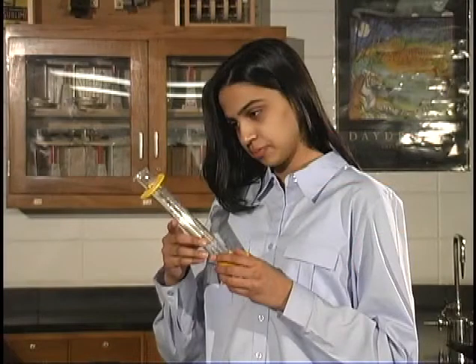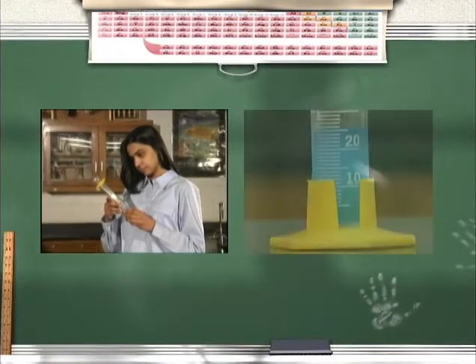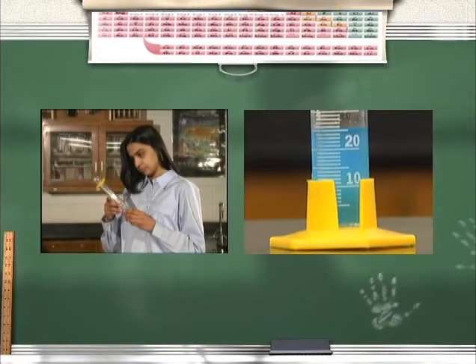Now, we are going to make some volume measurements. We are going to want to make sure we read our instruments correctly as we make these measurements. First, let's find the volume of a liquid. Here, we have a graduated cylinder with a colored liquid in it. In your notes, write down the measurement you read. In case you have forgotten, a graduated cylinder like this one measures in milliliters.